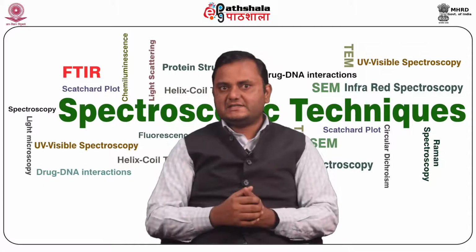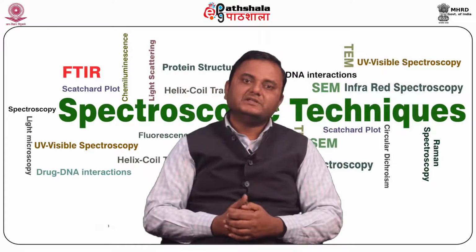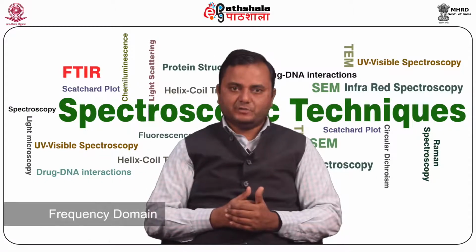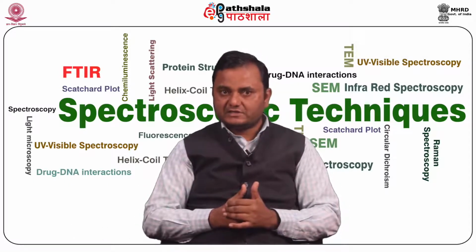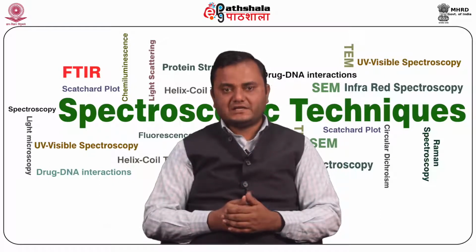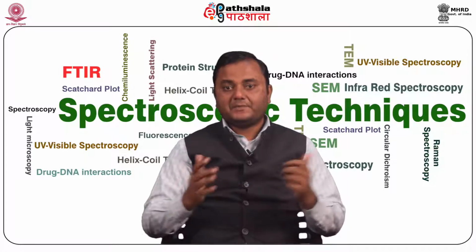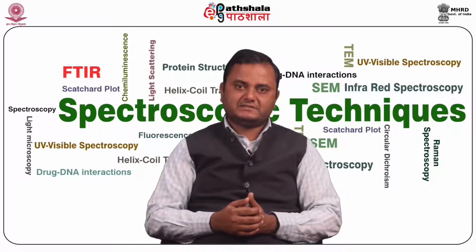So now we can discuss what the Fourier transform is. You first need to understand what the Fourier transform is. The Fourier transform defines a relationship between the signal in the time domain and its representation in the frequency domain. Being a transform, no information is created or lost in the process, so the original signal can be recovered from the Fourier transform and vice versa. The Fourier transform of a signal is a continuous complex-valued signal, capable of representing real-valued or complex-valued continuous time signals.